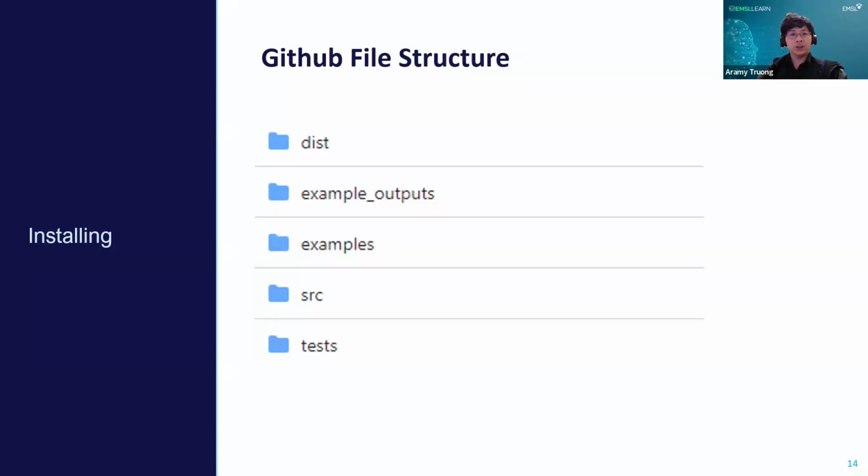If you just want to learn how to use Pore2Chip and use it effectively, including all the parameters for the functions, there are example Jupyter notebooks in the examples folder here. And one of those Jupyter notebooks will detail how to get straight from raw XCT data to a micromodel design. And we're going to talk more about that today.